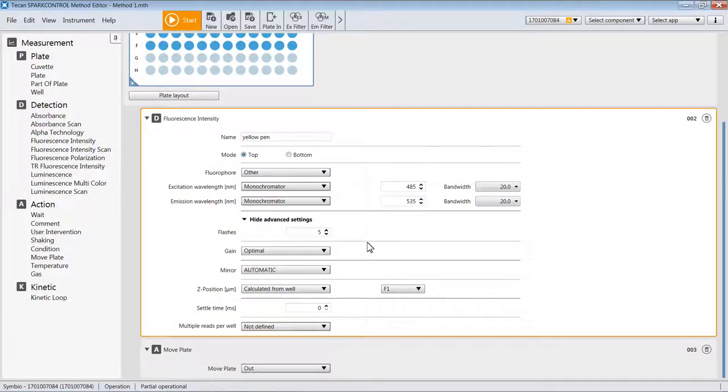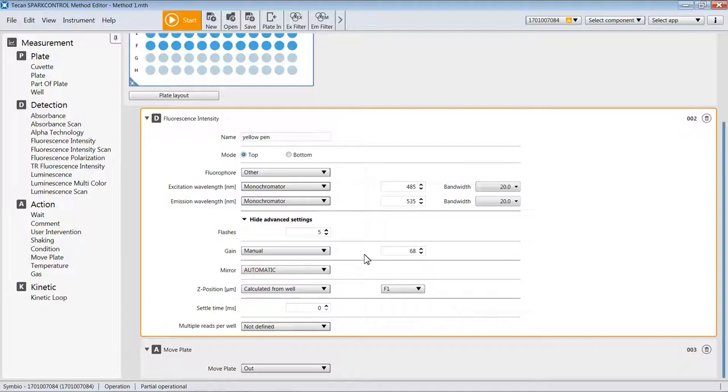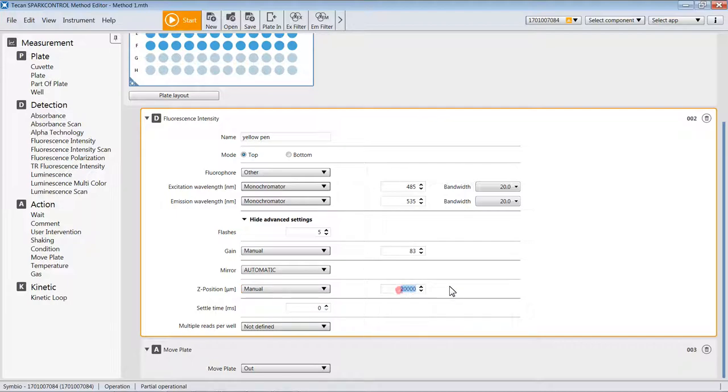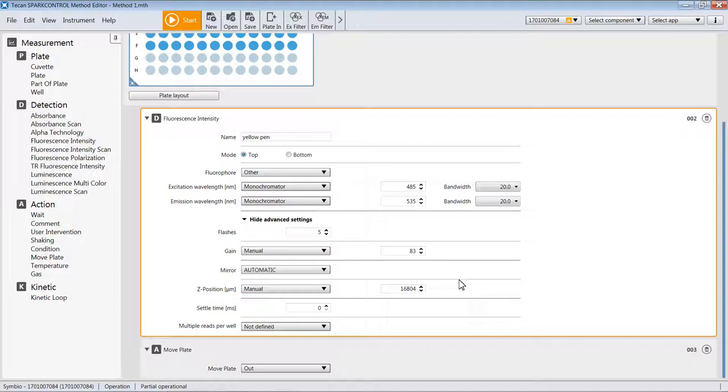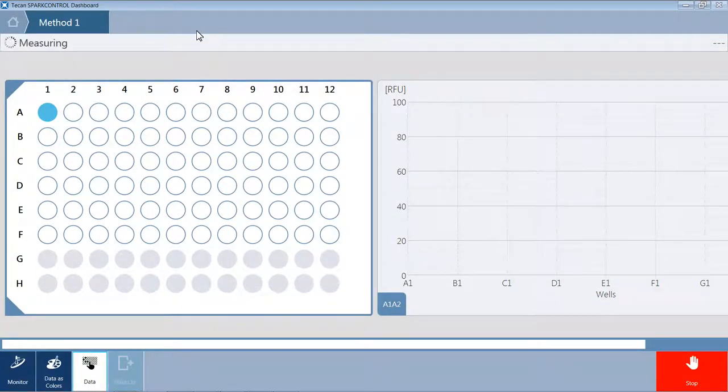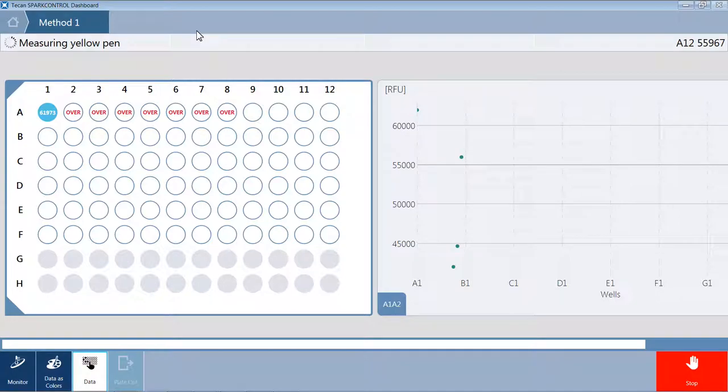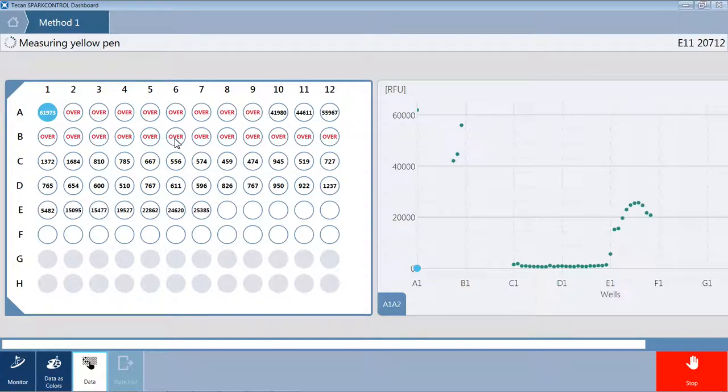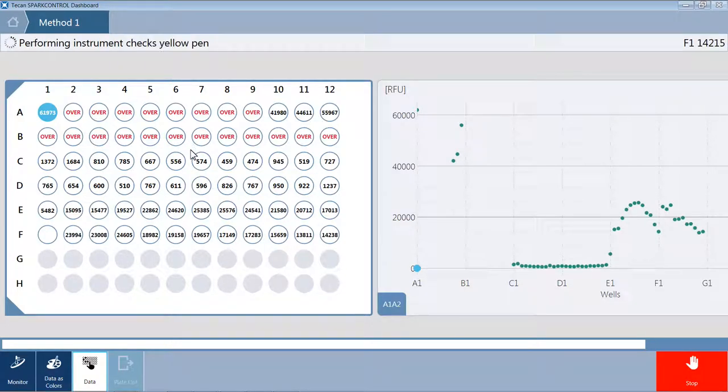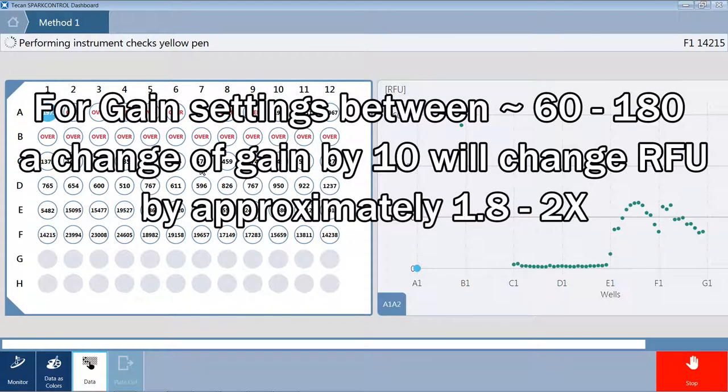Now that we have some data where we've got ideal gain and ideal Z, let's change things so that we can see how these different settings like bandwidth and wavelength and gain affect the signal. Our previous ideal gain here for this plate was 73. We're going to change the gain to 83 and fix the Z at the previously determined optimal Z and run this again. Now you'll see that once we've raised the voltage on the detector by 10, we're getting overvalues, which means it's over 65,000. It's also increased the intensities of other samples on the plate. For every change of the gain by about 10, you will see an approximate 1.8 to 2 times change in the intensity.